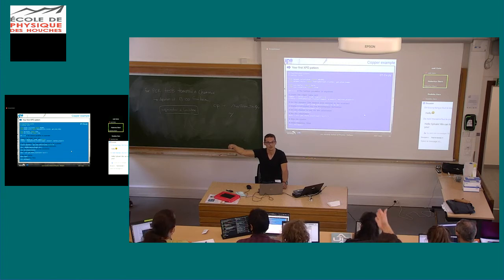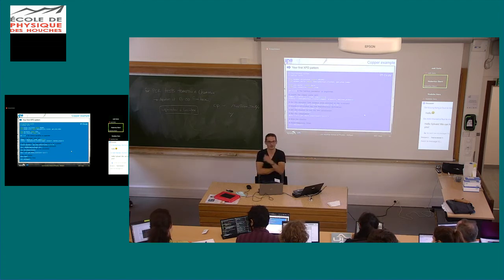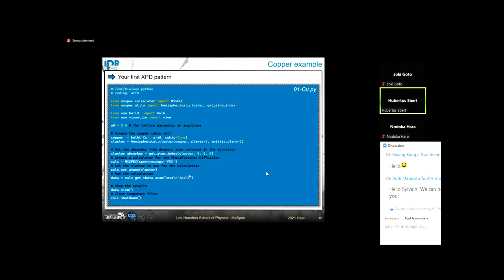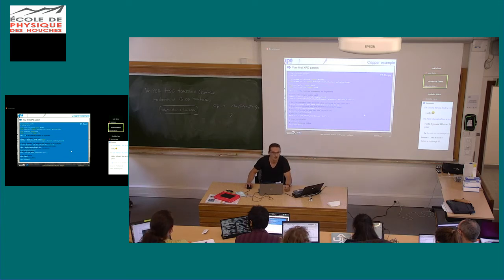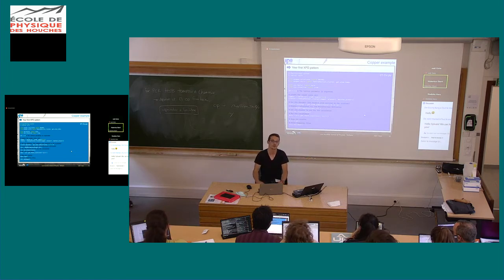And if it is blank, then what kind of kinetic energy is it? That's what I was saying a few minutes ago. It is computed according to the level that you specified here, the electronic level, and the energy of your source. The default energy of your photon source is the Mg K-alpha lab source, 1253 eV, plus or minus 4 or 5 eV to take into account the work function, roughly.